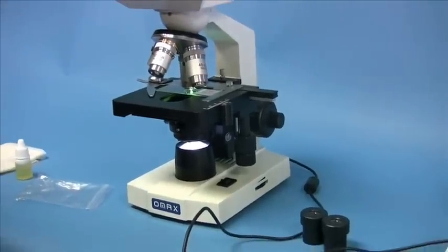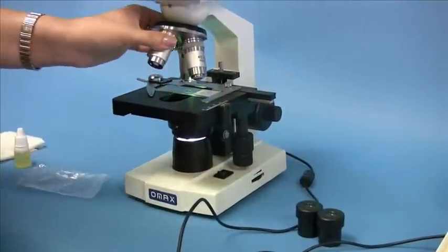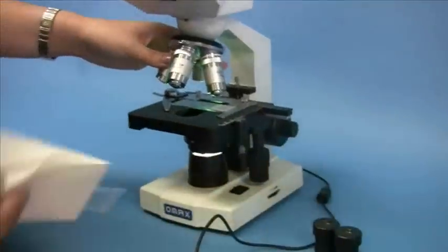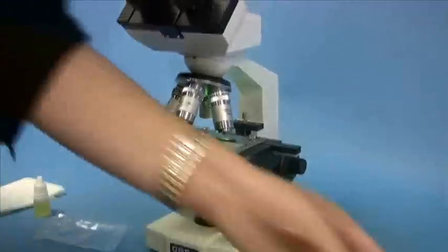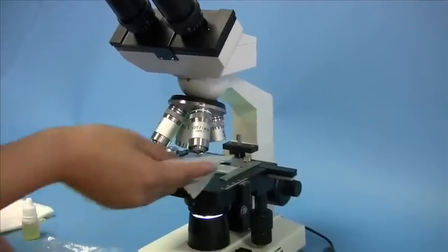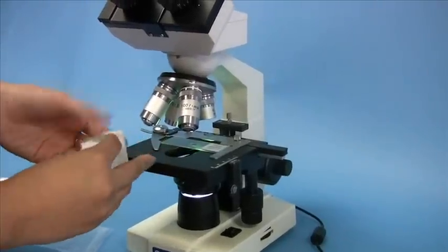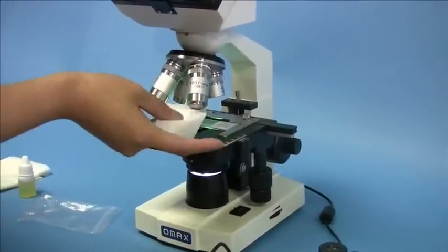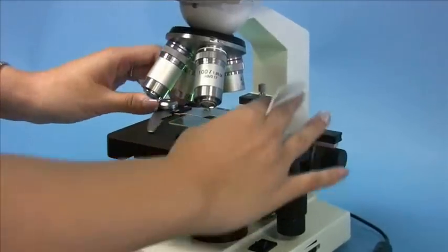Now once you're done with your observation, you need to clean the 100x objective and the slide immediately. So simply use a lens paper that is also not included in the microscope package. And clean it very gently like this. Just make sure that there's no more oil on the objective lens, and also the slide.